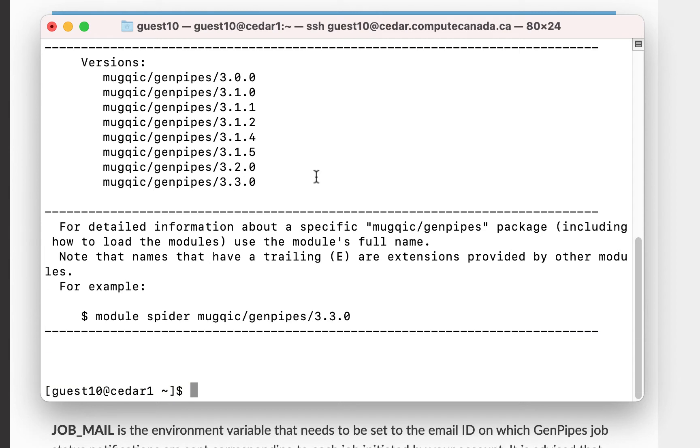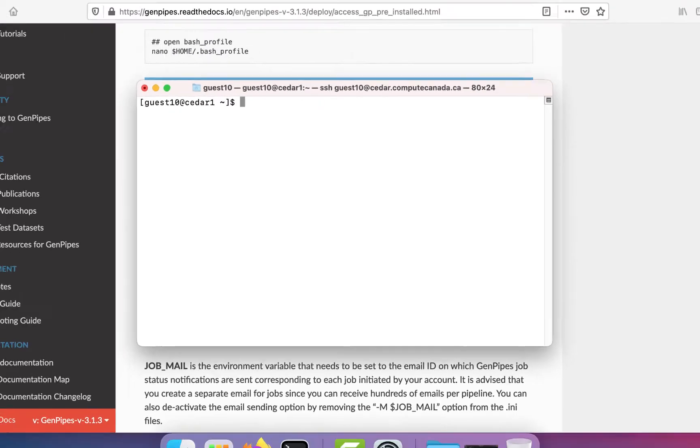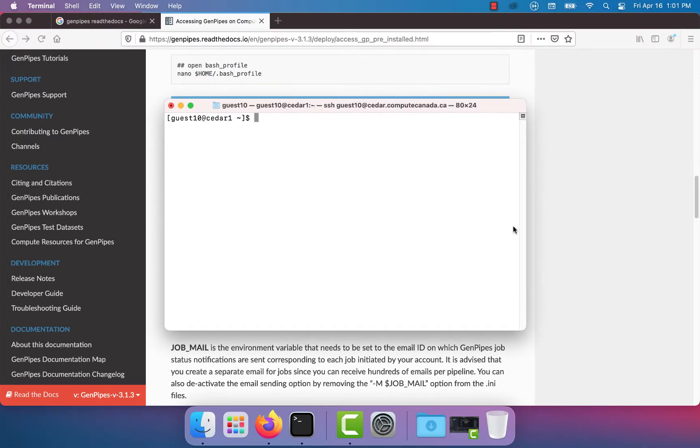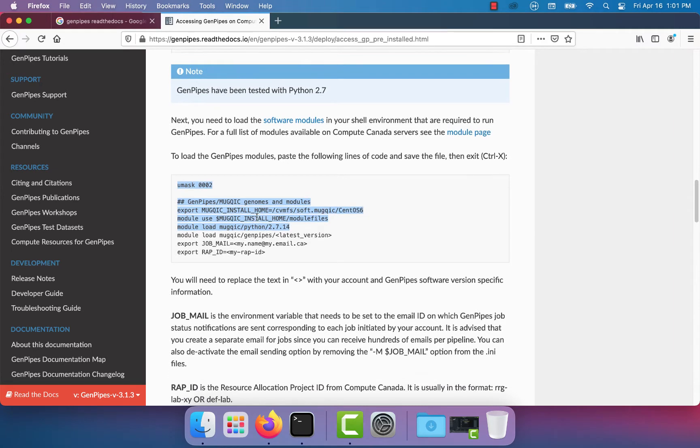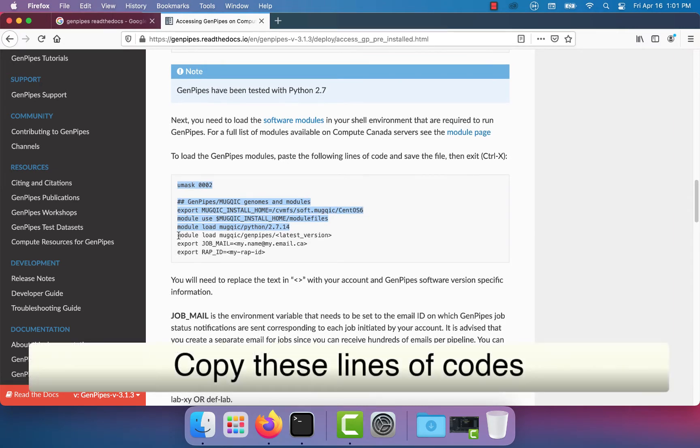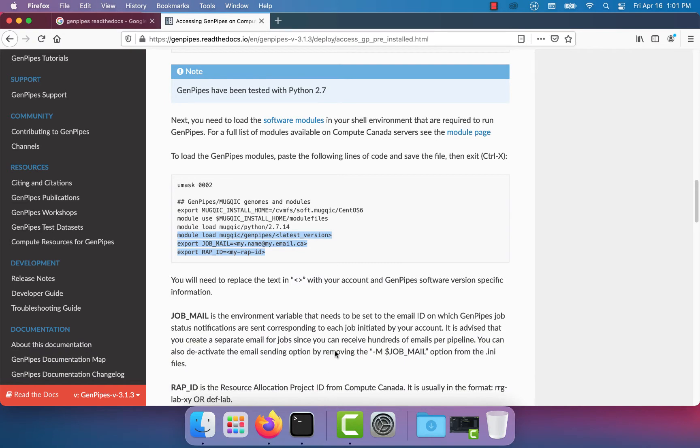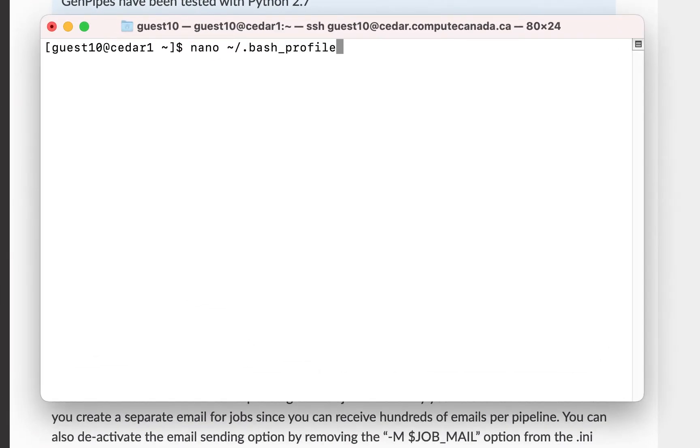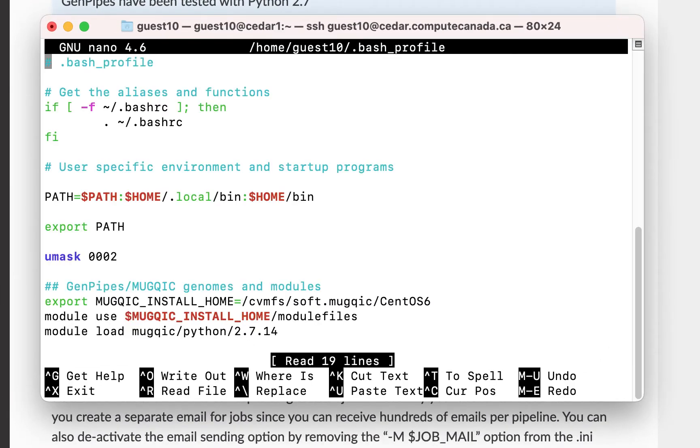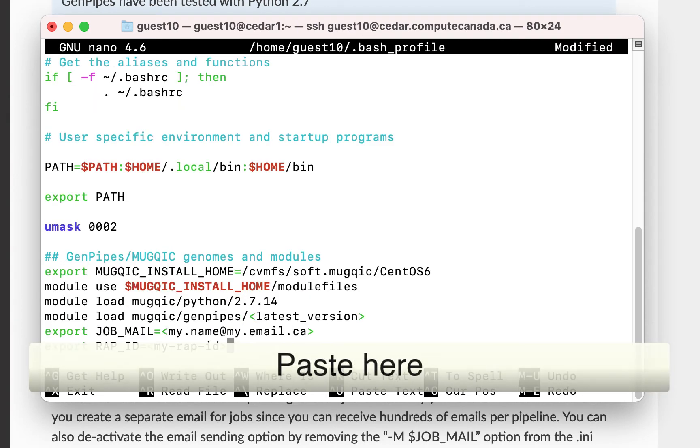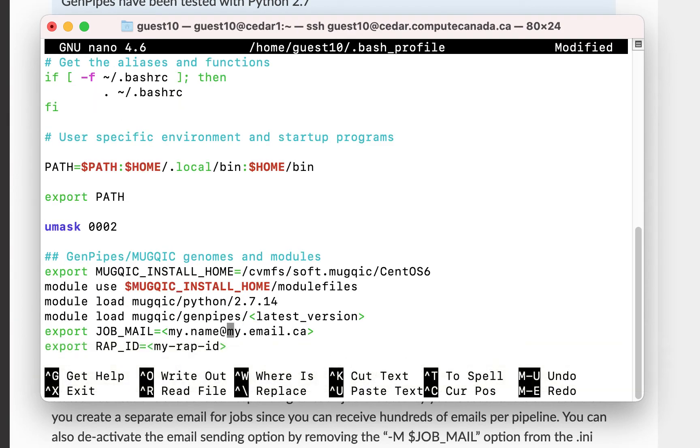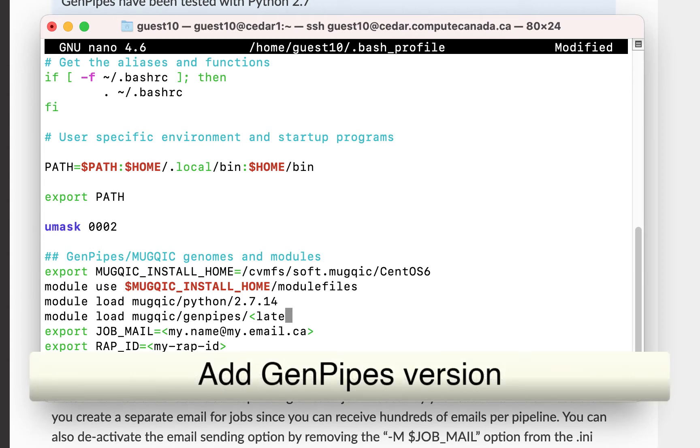However, you may use the latest version when you are running GenPipes. Now, go back to the GenPipes documentation. Copy these lines of code, open the bash profile and paste them at the bottom. To indicate the latest GenPipes version type 3.3.0.